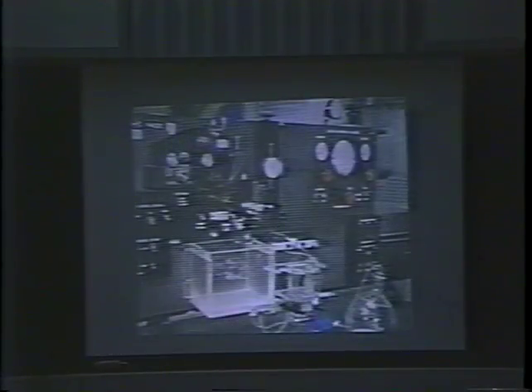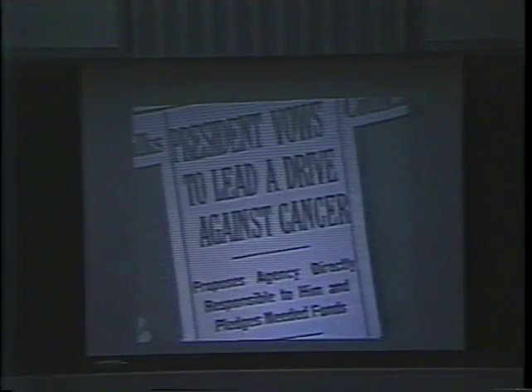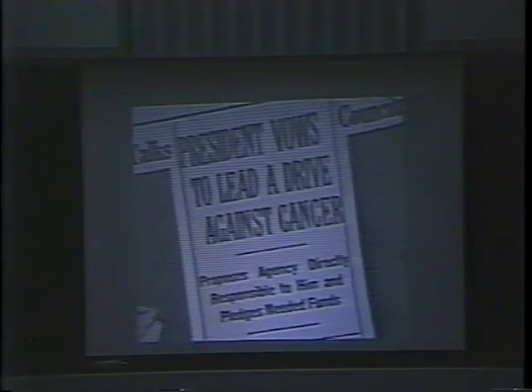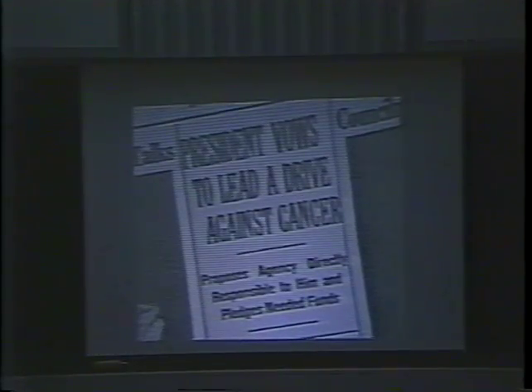With that 1969 grant, they were able to perfect their first prototype cell sorter and win an even bigger grant from the NIH, this time from the War on Cancer funds, to build 2 machines, one for Stanford and one for the NIH, with the hope that they could become commercially viable.